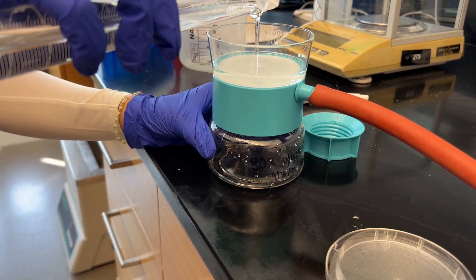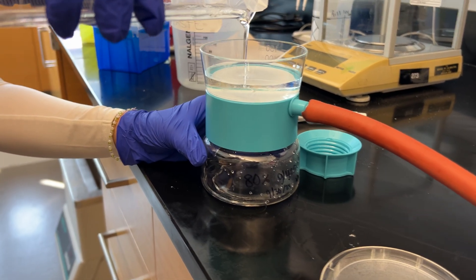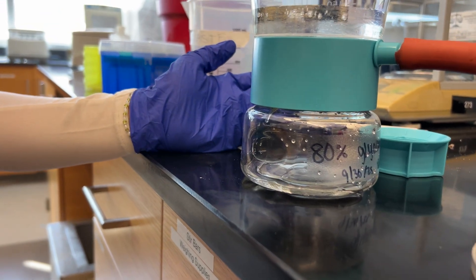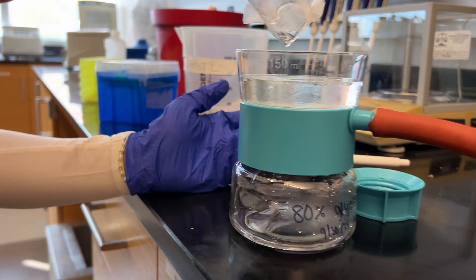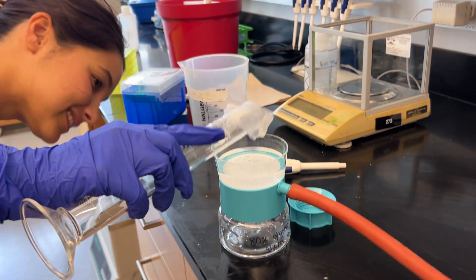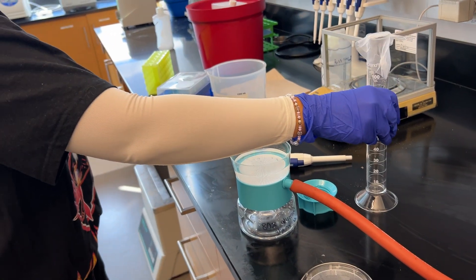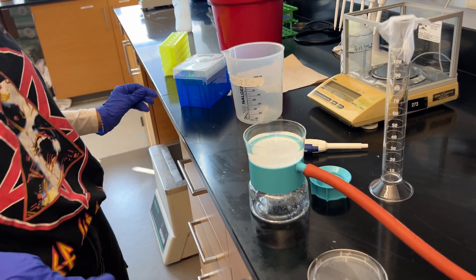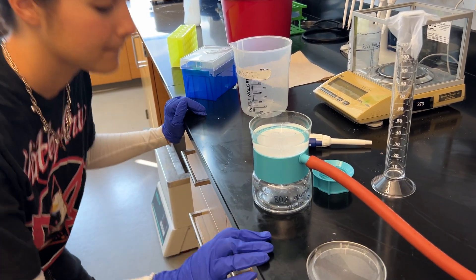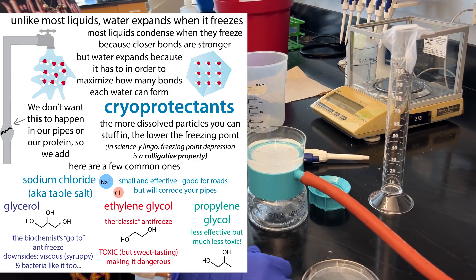It filtered a little slower than other solutions, but it'll definitely filter through if you give it time. So we'll just give it a minute, and then we can go add it to our purified protein. When we purify protein and want to freeze it, we don't want ice crystals to form in our protein, so when we add the glycerol it serves as a cryoprotectant — an antifreeze.